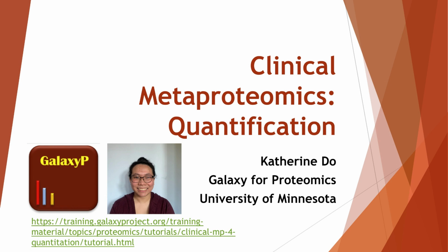In this video, we will cover peptide quantification. The video preceding this one covered Module 3, peptide verification. If you are just joining us, please watch the previous videos where we provide background on the clinical metaproteomics field and delve into database generation, peptide discovery, and peptide verification. They will prepare you for this video.